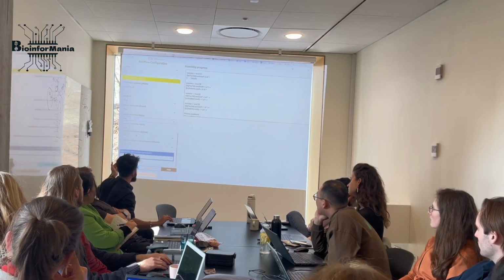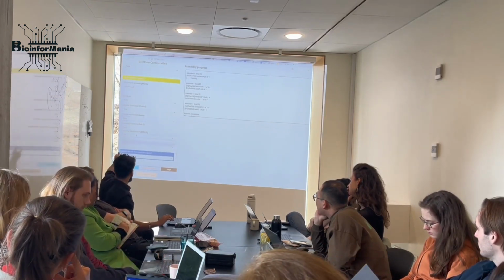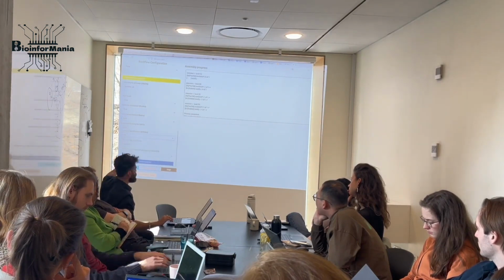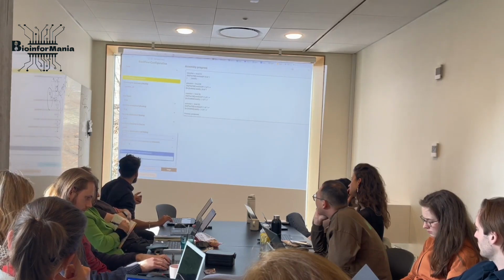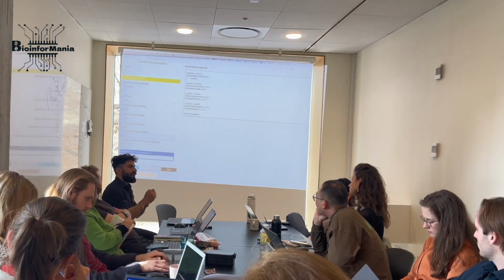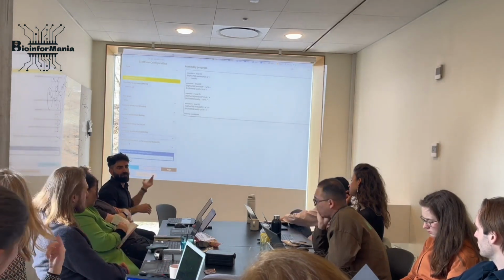And if you want to do taxonomy classification, assign it to a taxonomy level, you can set true. Again, you need a database for it. Okay, I don't have them. For now, we want to have that FASTA file. We want to have that assembly. Later, in the post-assembly module, you can do whatever you want.